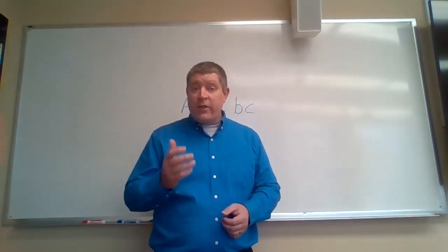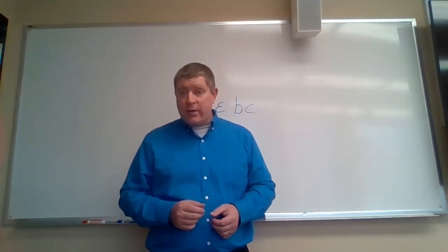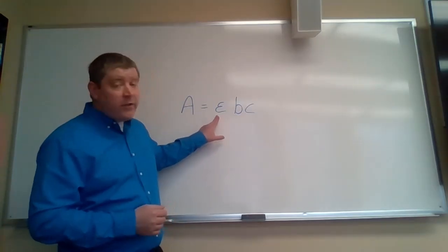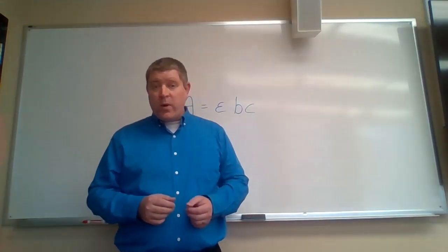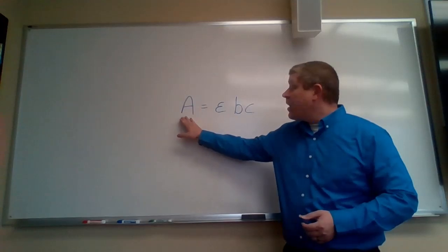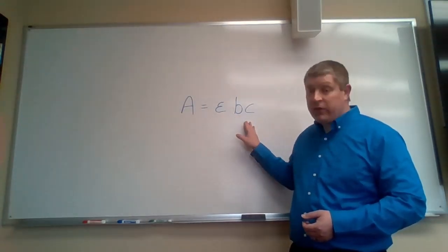And the last factor is the amount of light of that particular wavelength that gets absorbed by the solute. We call this value the molar absorptivity and symbolize it with epsilon. The molar absorptivity will vary with different solutes and with different wavelengths. And when we combine these, we get Beer's law. So the absorbance, symbolized here with an A, is equal to epsilon BC.